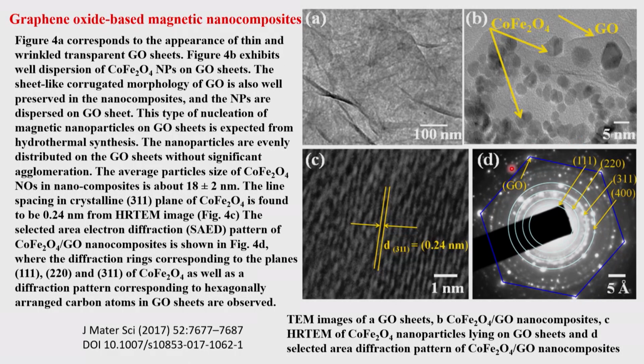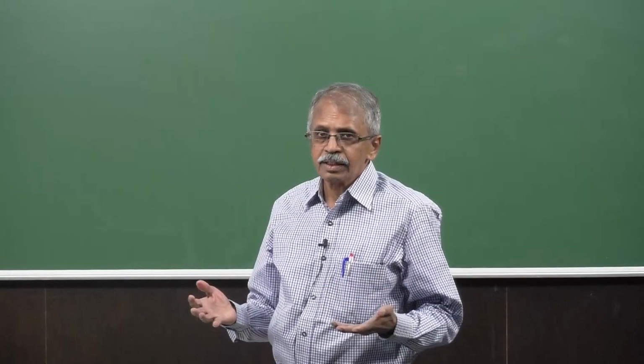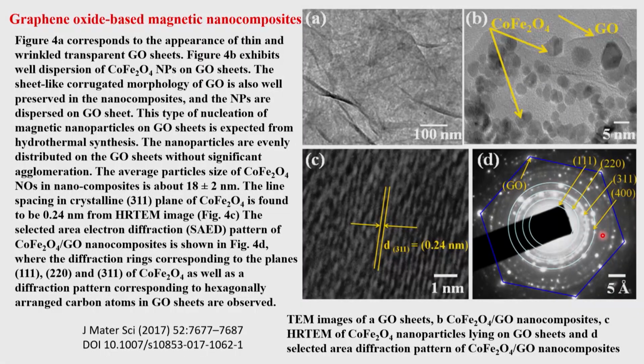So these are electron diffraction patterns of a selected area. I draw your attention to the slide, and you can see the rings and the spots which are connected with the rings, labeled with different planes. So HKL planes 111, 220, 311, etc. From this, what do you get? You get the crystal lattice, the crystal structure as a whole. So from that, you can correlate the properties with respect to what you want.